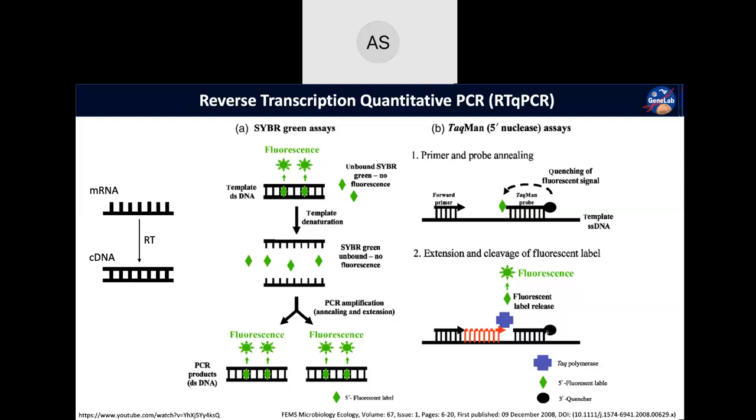And so, Aylin, question. Yeah, just to clarify, is the TaqMan used with SYBR Green? Like we're showing the TaqMan, the use of the probe and quenching of that signal is what reduces the background noise? Are these two separate assays? These are two separate assays. Got it. So if you were to add in your SYBR Green along with this, it would kind of confuse the system and actually probably enhance your fluorescent signal a lot more quickly. And you'll also still have all the caveats of the SYBR Green, like the background noise and non-specific binding. So yeah, these are two separate assays.